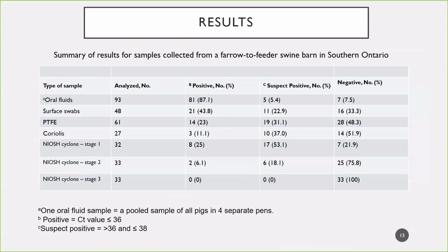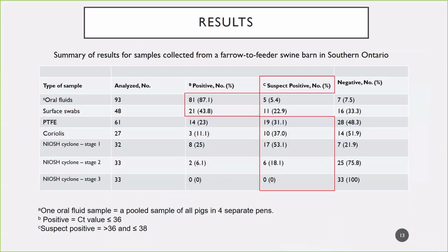These are the results from the barn. Along the left-hand side, you can see the types of samples that we collected, and along the top, you can see positive, suspect, or negative samples. In the positive column, you can see that 87% of our oral fluid samples were positive, and 43.8% of our environmental samples were positive by PCR. I also want to look at the suspect positive column. The air samples actually had a lot more suspect positives compared to positives. This was based on the CT value of 36 on our qPCR. Next slide.